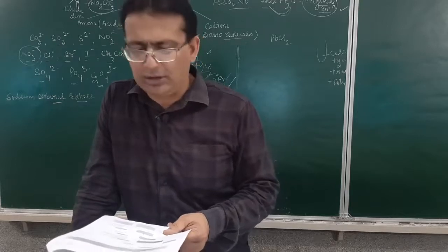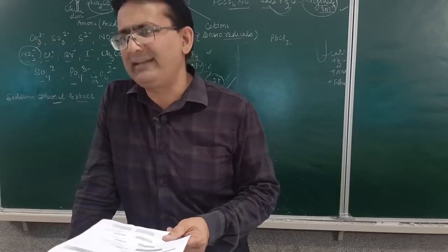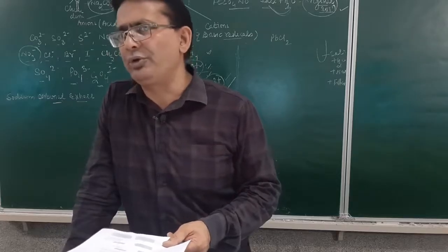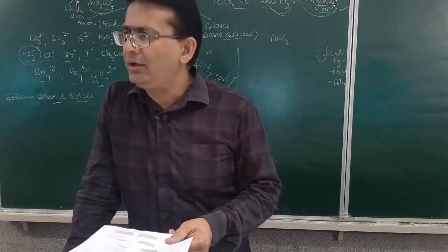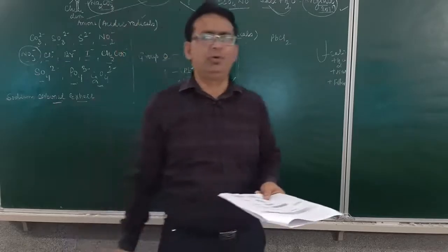Black, yellow or brown colored precipitates obtained will indicate the presence of group number 2. If group 2 is present, the filtrate will be kept for the 3rd group and the residue will be used for the test of the 2nd group. In the filtrate, you may boil off H2S, heat with concentrated nitric acid, and add a pinch of ammonium chloride and ammonium hydroxide.